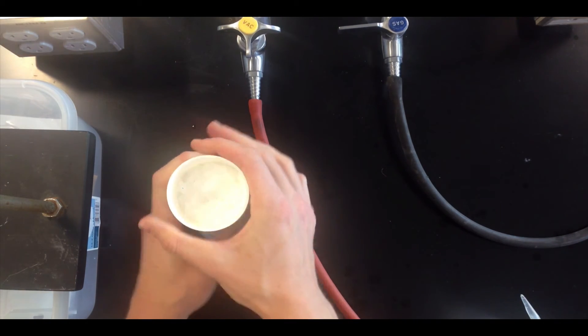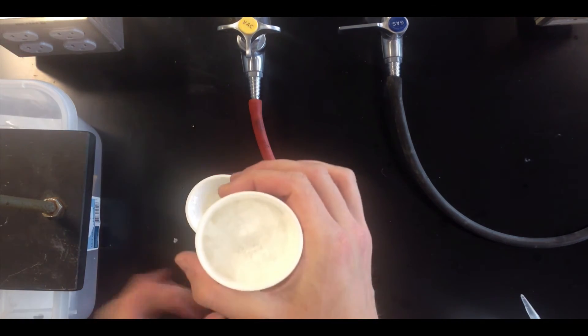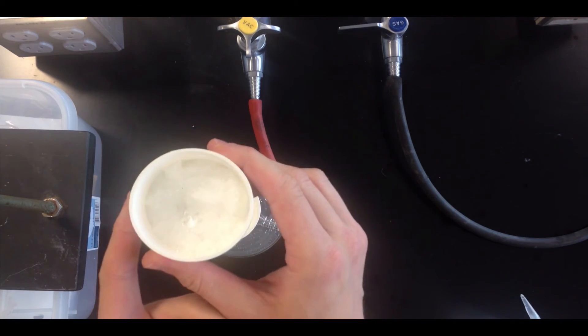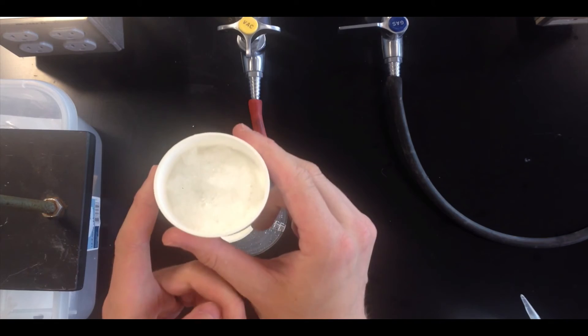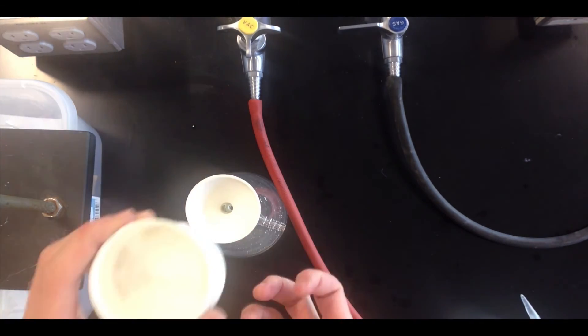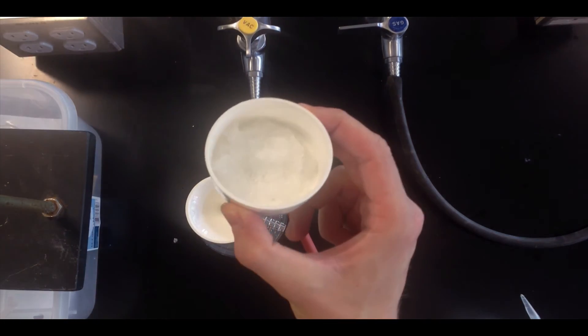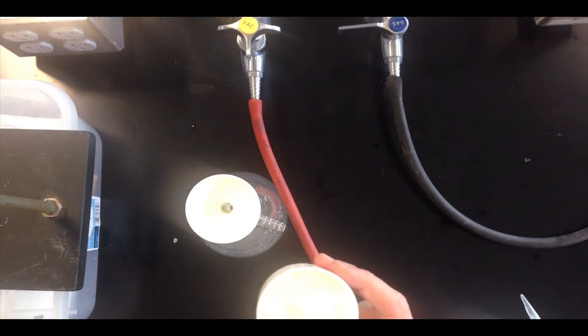And from here, you can remove the top half of the Buechner funnel and work with this part independently. So if you're being super clever, you could, for example, weigh this part of the Buechner funnel and the filter paper before filtering the solid, and then weigh this entire thing again to get the mass of solid only.